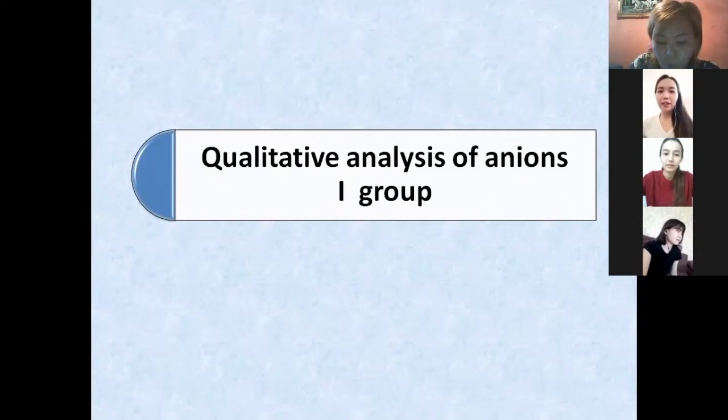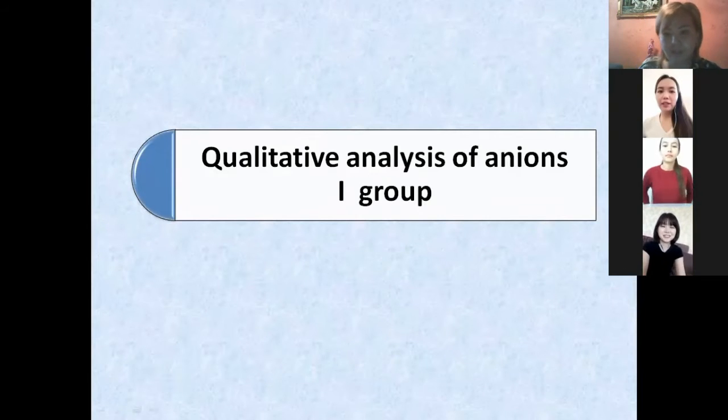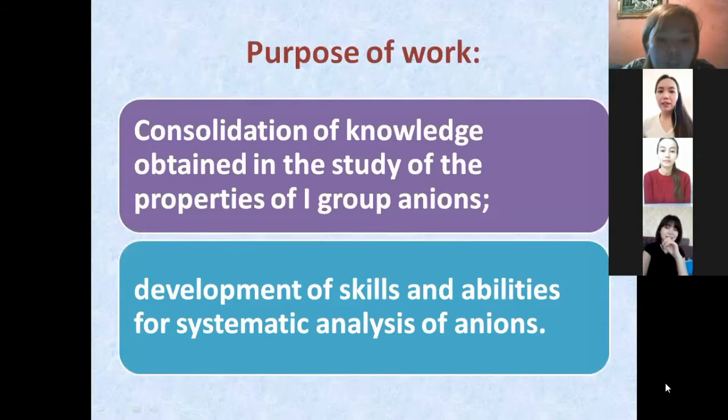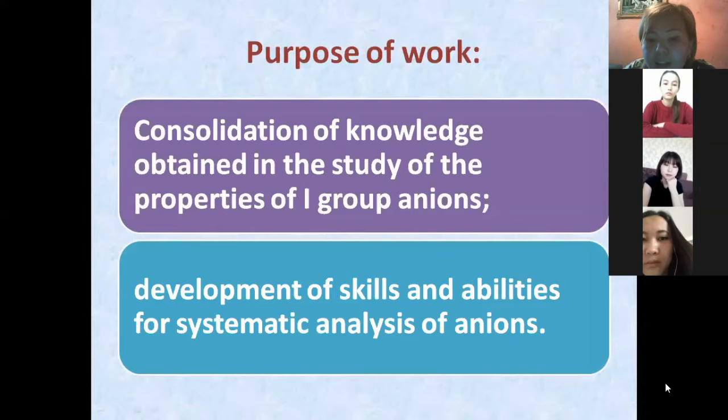The theme of our lesson today: qualitative analysis of anions, first group. Purpose of work: consolidation of knowledge obtained in the study of the properties of first group anions, and development of skills and abilities for systematic analysis of anions.